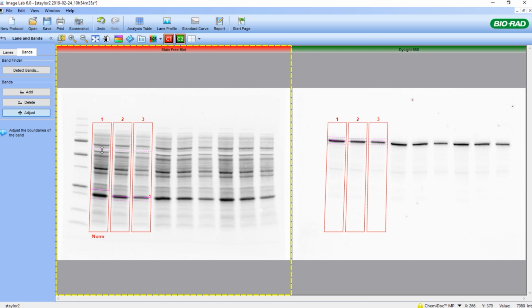So of course it's very important to set the markers at the same place on each lane so that we're being consistent with the normalization of the proteins that we're going to use to normalize by. I usually select a region of the membrane where I have good signal to noise and no artifacts of transfer, like air bubbles or regions of large amounts of density that could be at the bottom or at the top of a lane. So this permits me to be a little bit more precise in the normalization using a more defined region of the membrane.